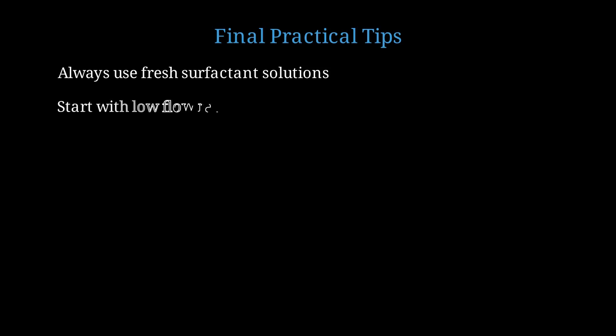Let me leave you with some final practical tips from experience. Always use fresh surfactant solutions. Old solutions can lose effectiveness due to degradation or contamination. When optimizing, start with low flow rates in the squeezing regime and gradually increase. This helps you find the stable operating window.